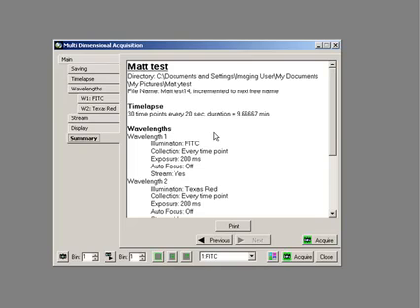It's a very neat experiment, particularly if you've got things moving very quickly over time. To make that work as quickly as possible, it's best to use that with a PIFACL stage or with a stage insert from Mad City Labs, the ones that are inside ASI, Pryor, and Loodle stages.